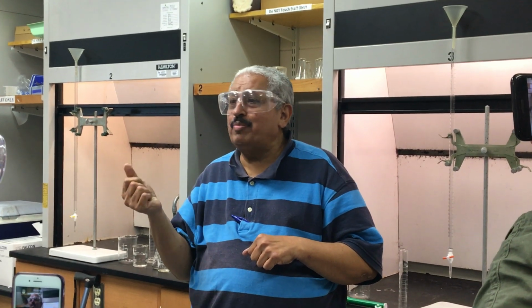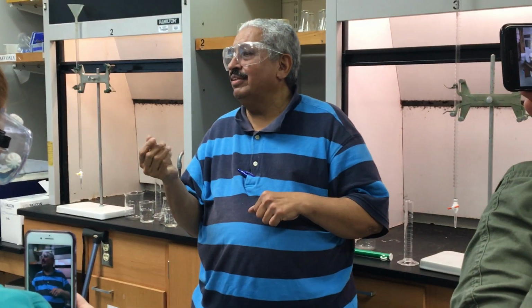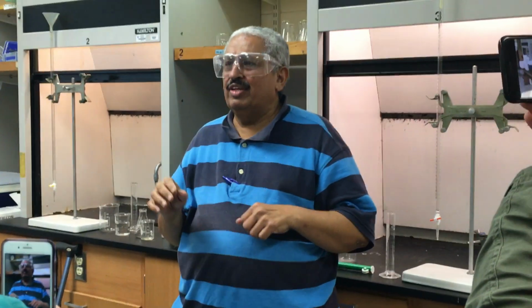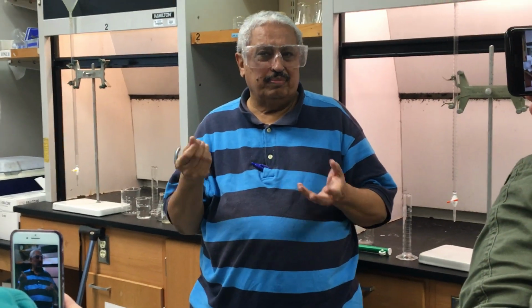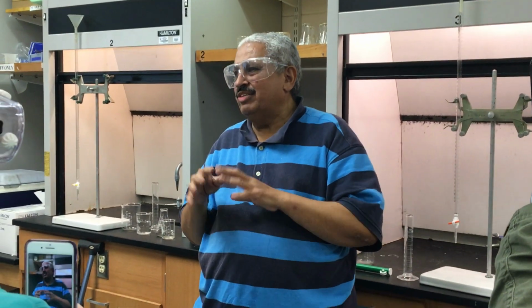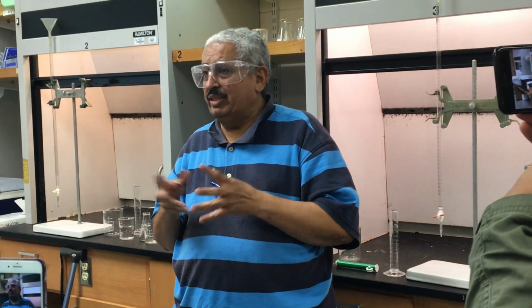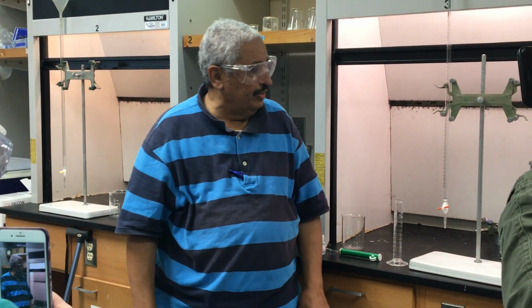Soapy means slippery. Any compound that's slippery has to be basic, not oil. The oils have nothing to do with this, but soapy inorganic compounds turn out to be basic, correct? And stingy stuff has to be what? An acid. That's a general rule. Litmus paper would be nice, but we don't have it at home, but you can differentiate between them. So today we'll have to titrate.